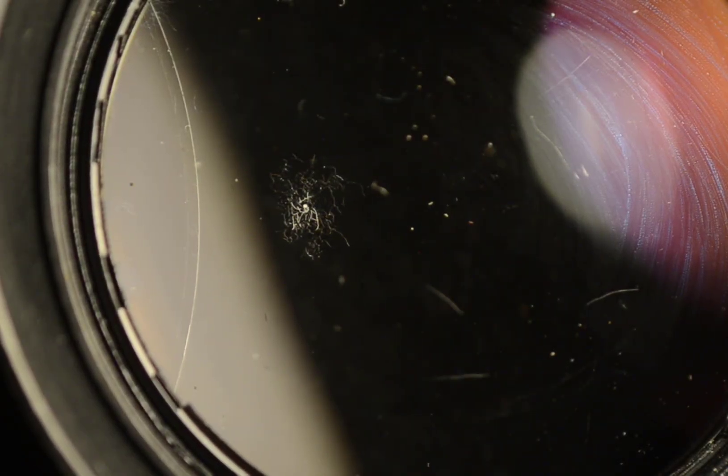This is the second type of fungus and it looks very differently from the one before. It has some kind of tendrils or filaments that come out, but the extension is not as before. We can take a closer look to see it.